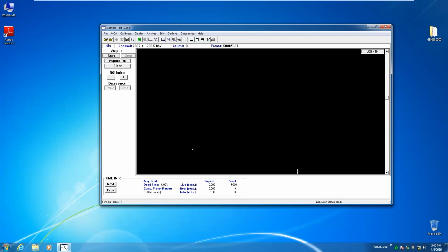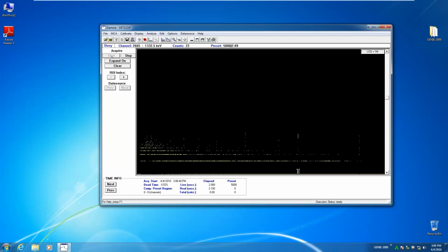Position the mixed gamma calibration source near the face of the detector end cap, centered on the axis of the end cap. The separation distance between the source and the end cap should be adjusted to prevent the percent dead time from exceeding 5% during the calibration count. After positioning the source, start an initial count to check the percent dead time value and evaluate the current channel locations of the observed spectral peaks.